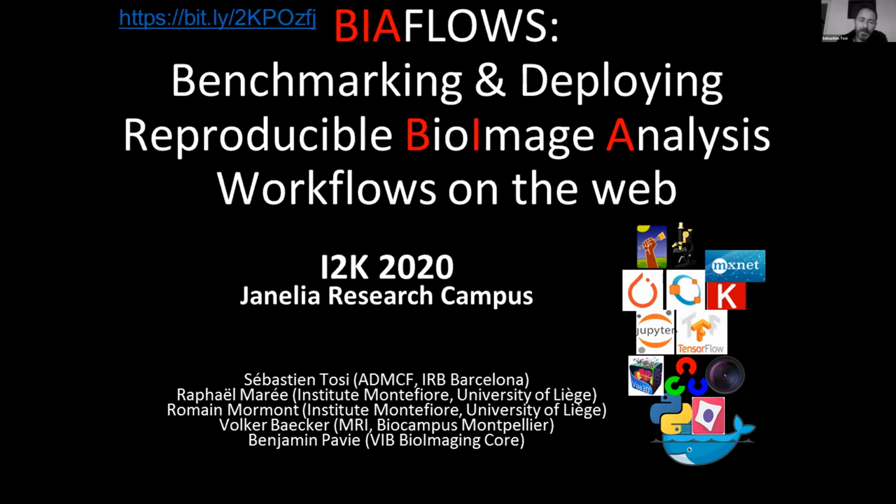I'm here today with some of the developers, actually almost all of them. So we have Raphaël Marée from Institut Montefiore. He is the lead developer of Cytomine, an open source project upon which BIAflows is based. Then we have Romain Mormont, a PhD researcher in Raphaël's lab.